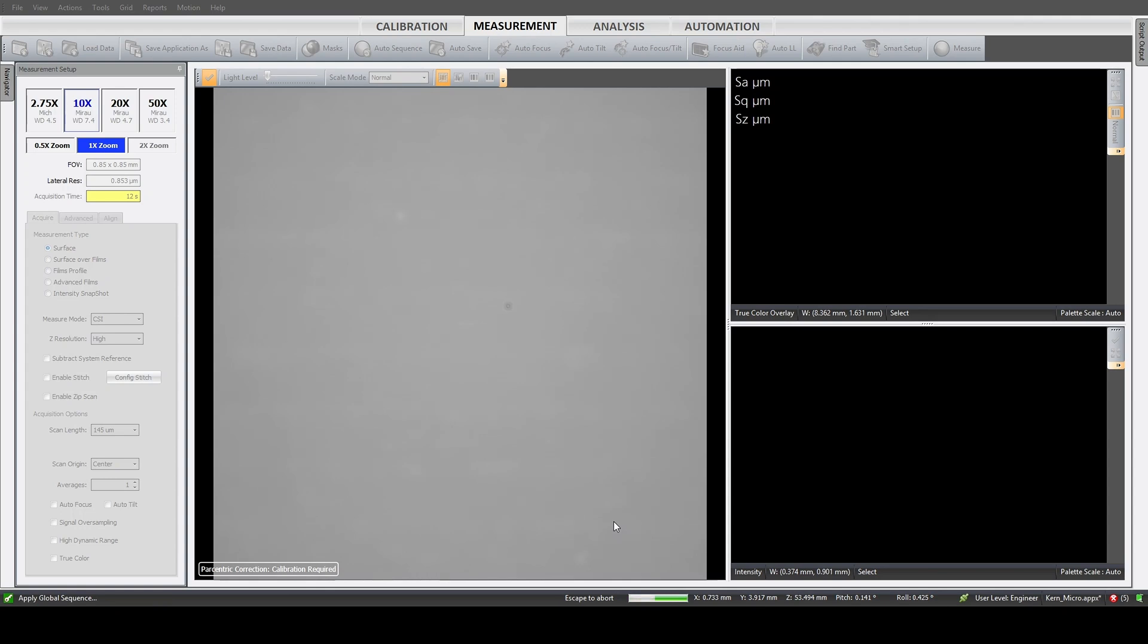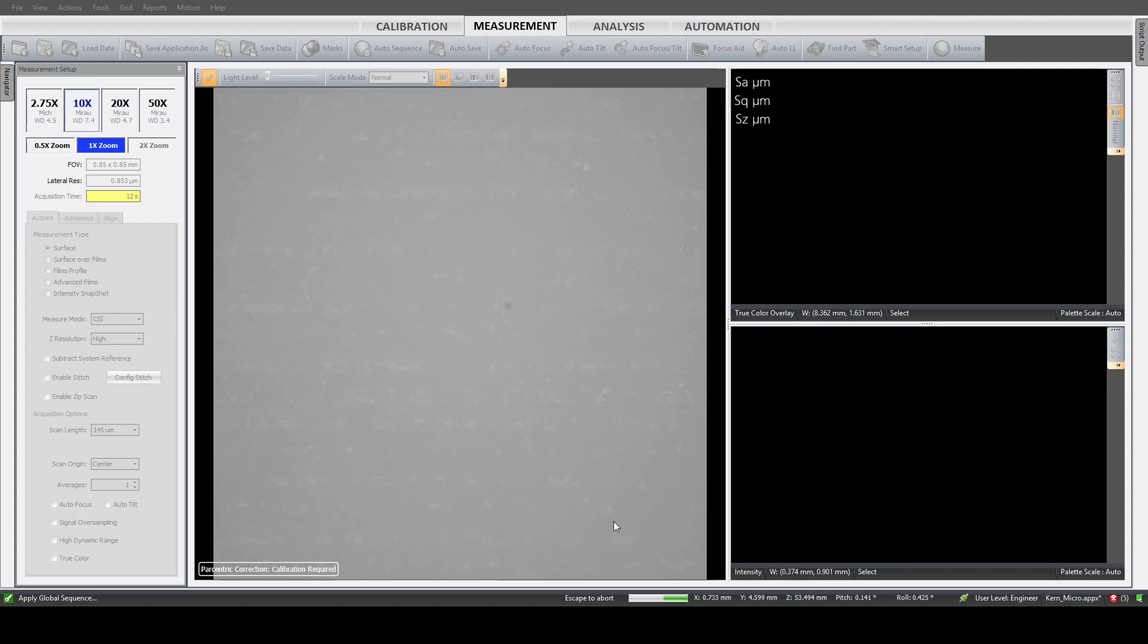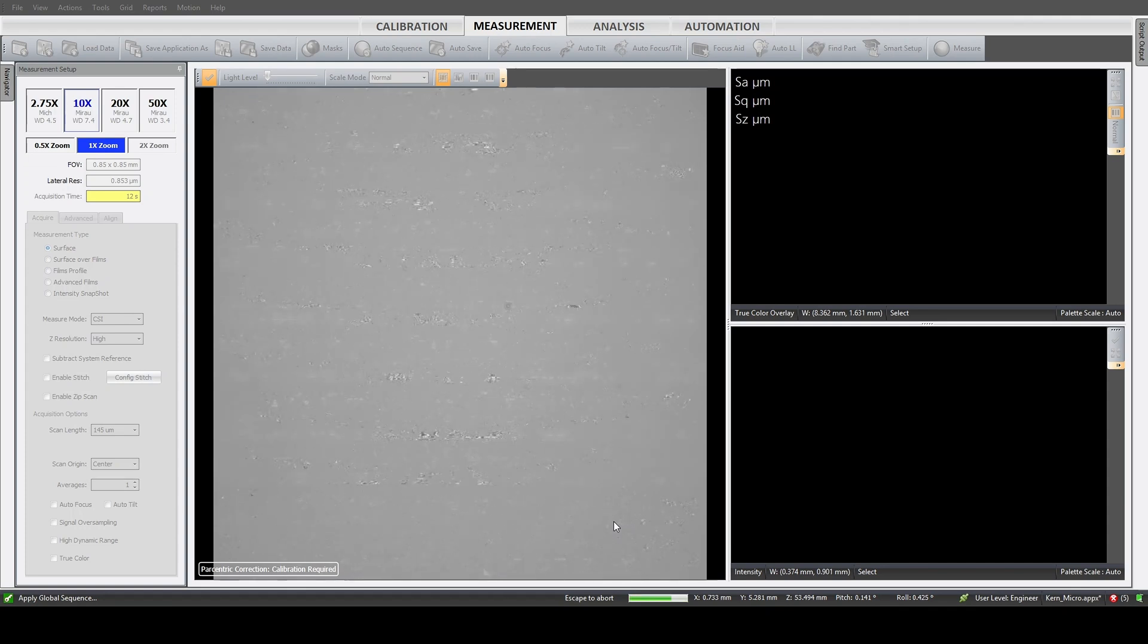We are currently stitching just four frames together. Typically, one has a bit of overlap between the individual frames. In this case, I choose a 20% overlap. This enables the software to align and match the data set. Recording stitched areas is always a bit exciting. You don't see much happening, and depending on the size of the stitch, you're left with a bit of process time. And then, suddenly, the result appears on screen. It's a bit like magic without knowing the outcome until it's there.